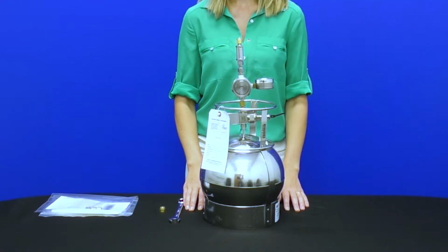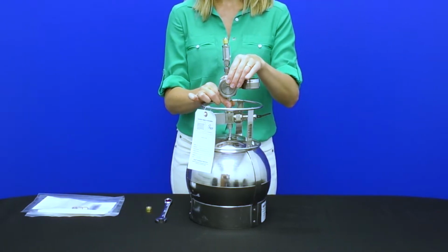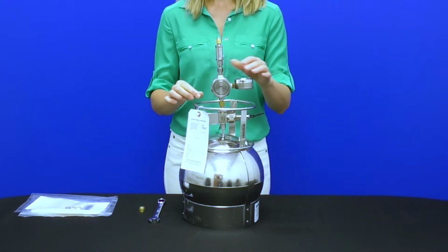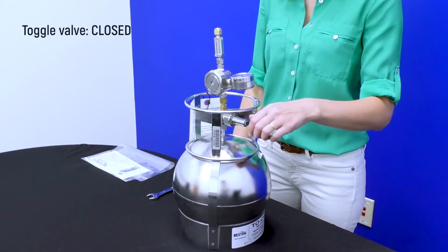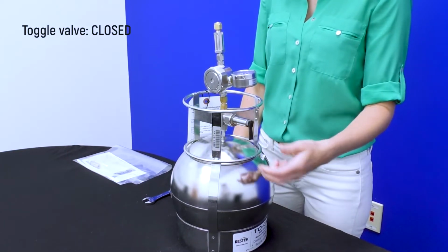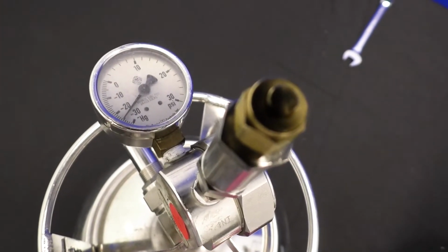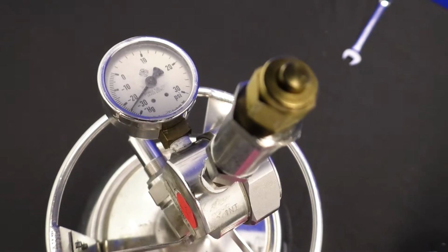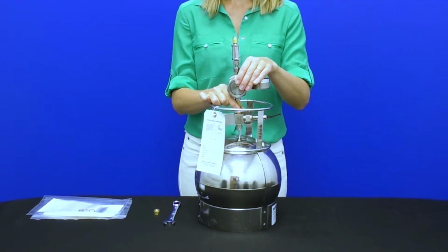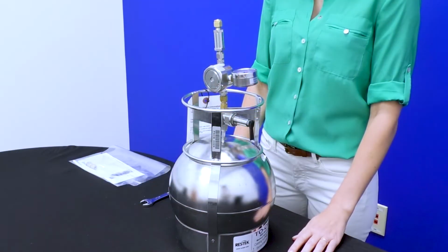If you hear hissing or see the gauge pressure dropping quickly, close the valve promptly and check fittings to ensure they are snug. Then, flip the toggle valve or turn the rotary valve back to the closed position. With the brass cap secure and the valve closed, the flow controller should hold the vacuum as originally documented. If the pressure drops, this could indicate a loose connection at the canister, at the brass nut, or within the flow controller, which may impact your sampling event.